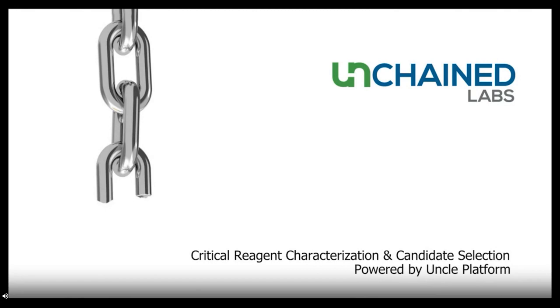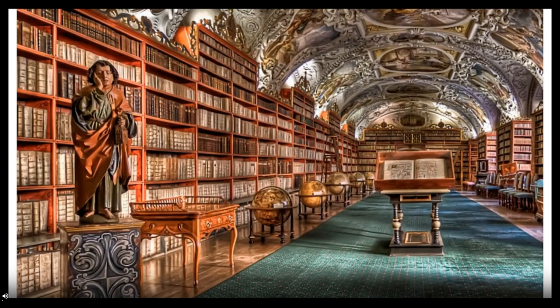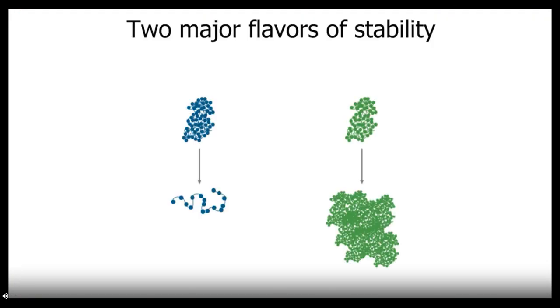Thanks for that introduction. I'll be introducing and giving some more background to the thermal unfolding and aggregation parts of this webinar and the instrument used for much of the analysis that you'll see. So when dealing with a hard choice between a lot of options for proteins as critical reagents, picking out just one best option can leave you feeling a bit like the statue on the left, overwhelmed. In this webinar, myself, Ron, and Adam will talk about how characterization using the UNCLE from Unchained Labs can help you ID the best performing options.